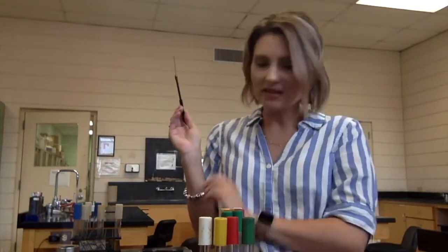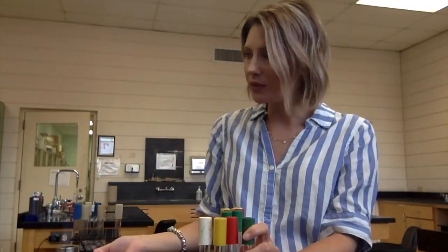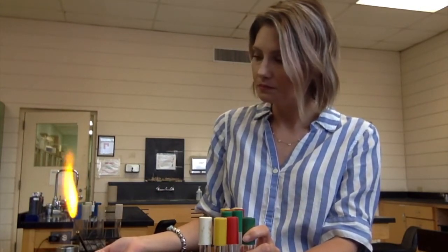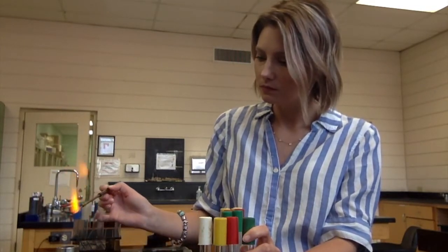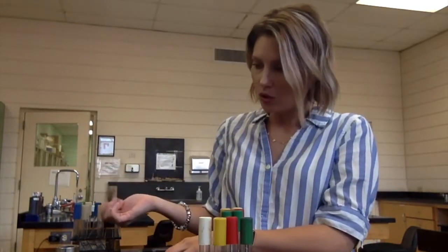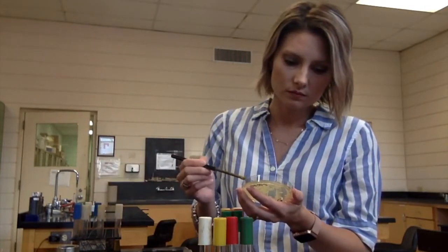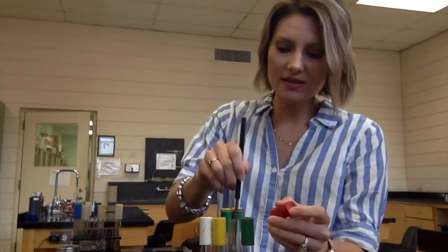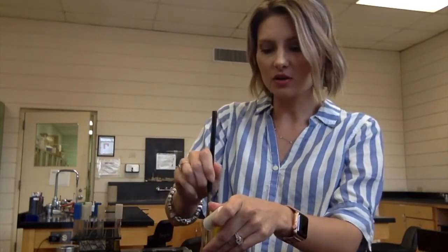Give me a little bit of bacteria. It doesn't take a lot. Dip, swirl. Flame my loop again. Make sure to burn off any of that media. Let it cool a little bit. Get my bacteria again. And I'm basically going to repeat this process for each tube. And last one is mannitol.